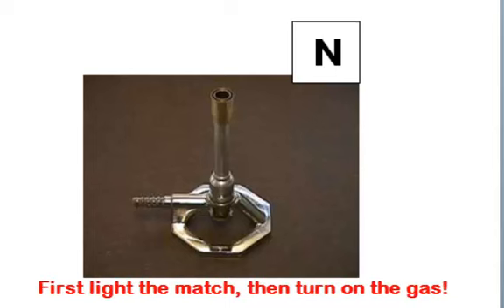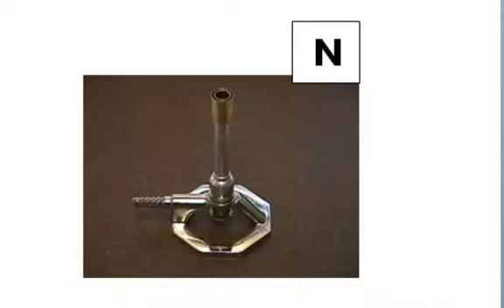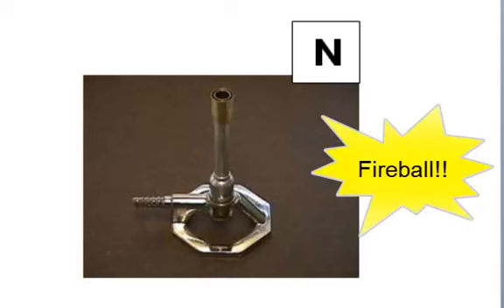First, you want to light the match. Then you want to turn on the gas. Because if you do it the opposite way, what will happen if you turn the gas on and then you light the match, that gas will be coming out of the top of that Bunsen burner and filling that air space with the gas. So when you light that match, it's gonna create like a little fireball right in front of you. And it could light your hair on fire. So we don't want to do that.